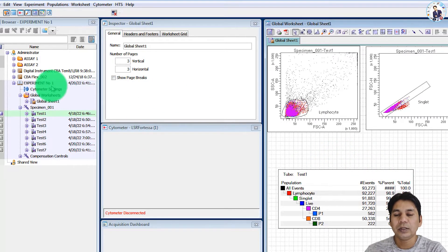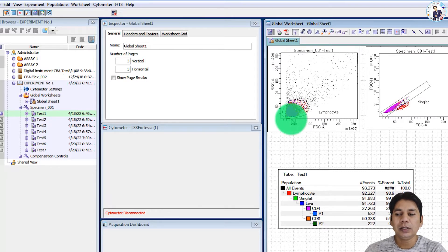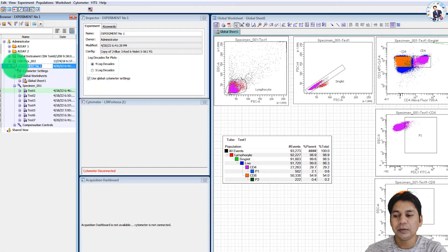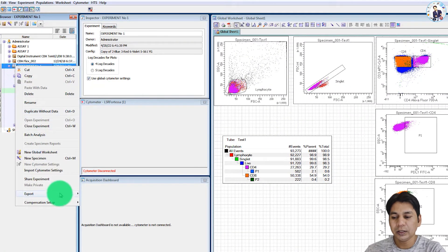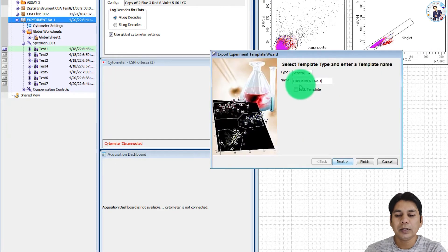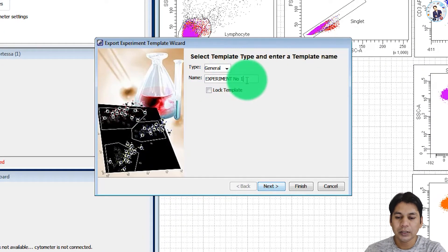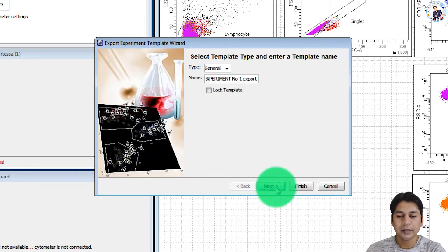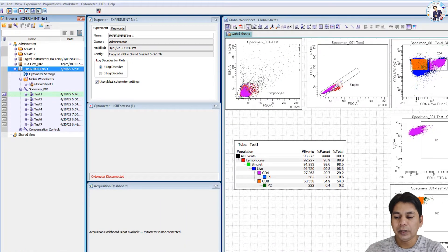To export these settings as a template — so that another person can use these settings for their experiment in future, or you can import them into FACSDiva software — right-click on the experiment, go to the lower side and select 'Export' then 'Experiment Template.' Here you can see the name; if you want to change it, you can. I am changing it to 'experiment number one export.' Click Next and then Finish.